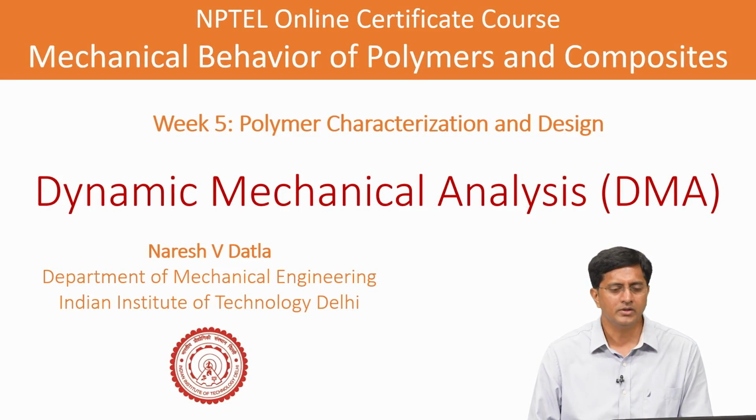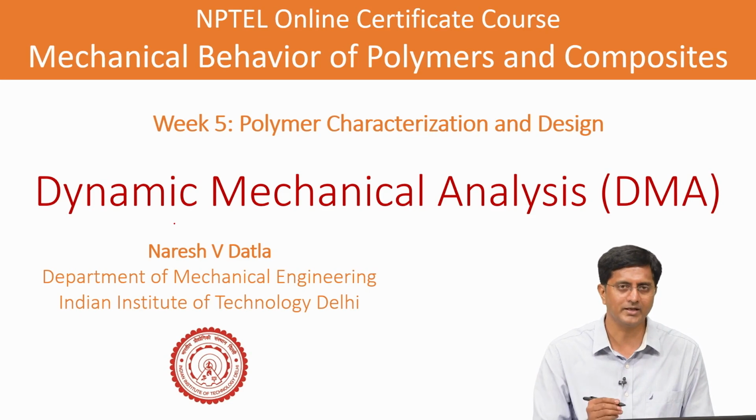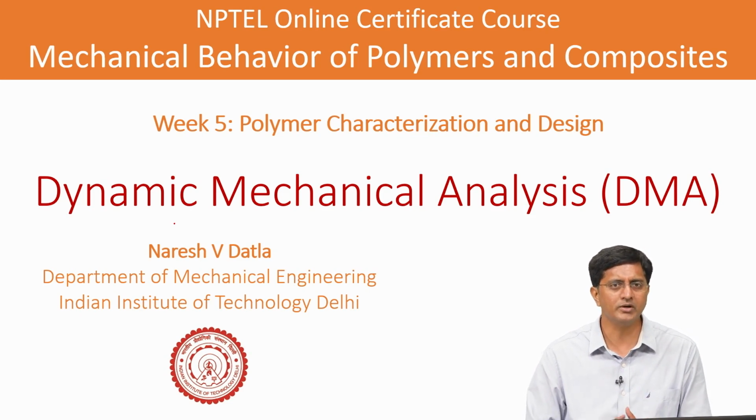Welcome to week 5. In this week we will be discussing the ways to characterize polymers. We will also conclude by looking at the design aspects for polymers. But in this video we will focus on dynamic mechanical analysis. This is a very common technique to characterize the dynamic properties of polymers.